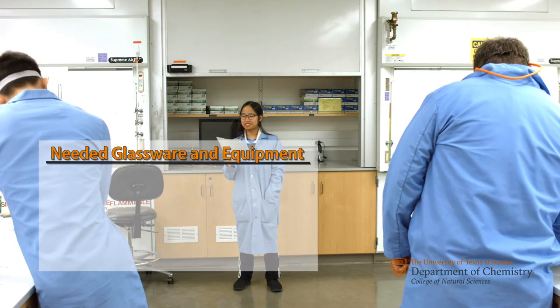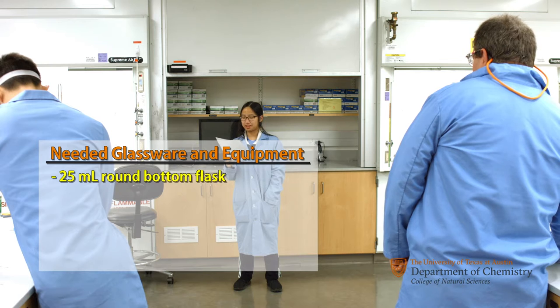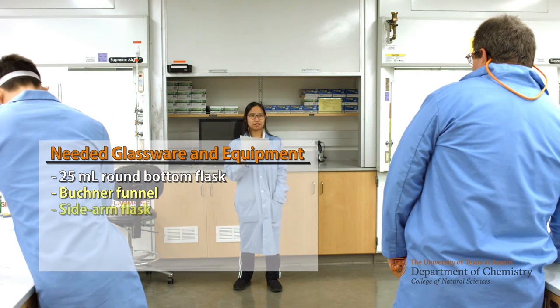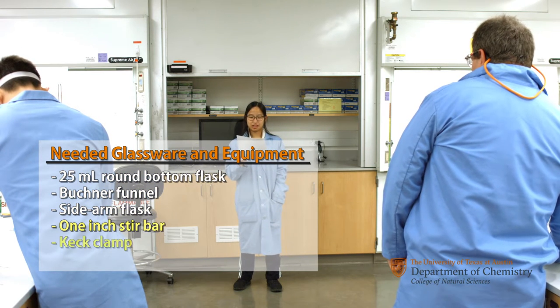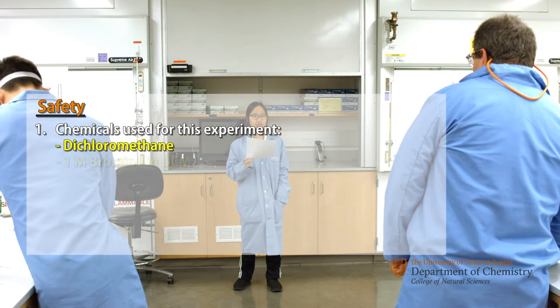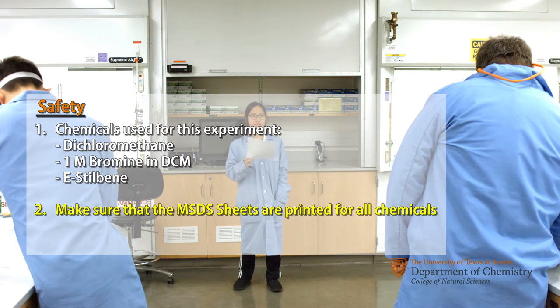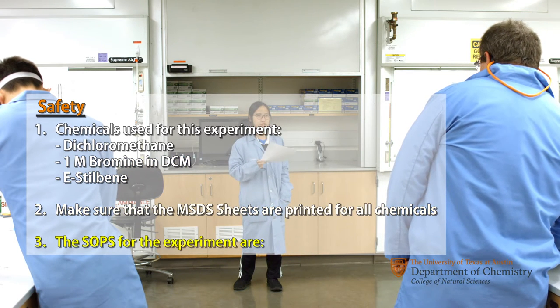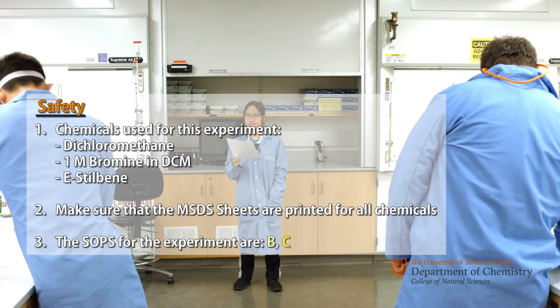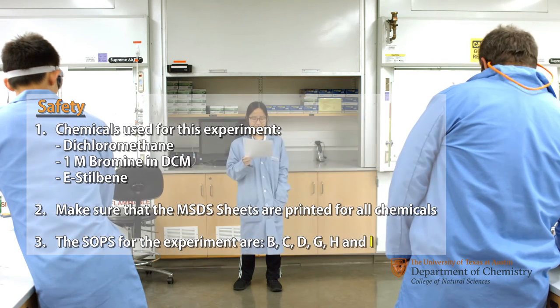Today we'll be doing bromination of E-stilbene. The glassware we'll use is a 25 milliliter round bottom flask, Buchner funnel, sidearm flask, 1-inch stir bar, Keck clamp, and a glass stopper. The chemicals we use are dichloromethane, 1 molar bromine in DCM, and E-stilbene. Make sure that all the MSDS are printed out. The SOPs for the experiment are B, C, D, G, H, and I.